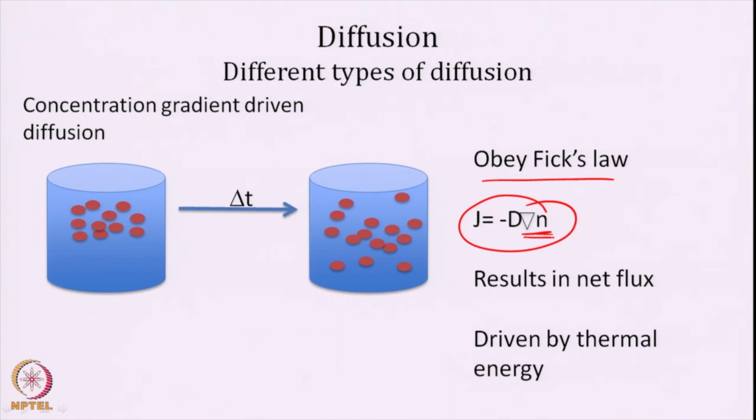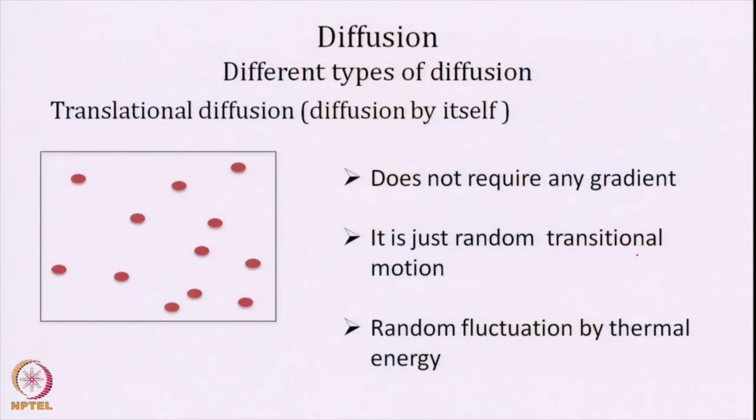As a simple example, if you take a pinch of salt and put it in water, it diffuses through the water. That is diffusion. There are different kinds of diffusion: translational diffusion, where molecules just diffuse in linear dimensions, and rotational diffusion, where the molecules rotate and then diffuse. The most common one is translational diffusion, and that is typically measured using NMR.